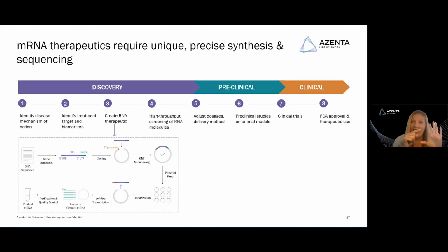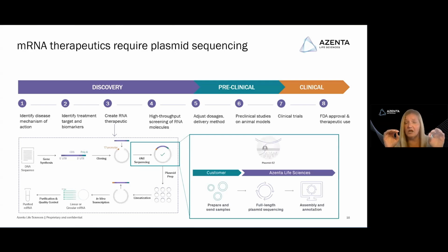The plasmid will have our backbone as well as our T7 promoter region, and we're going to put that all together, and then we need to sequence that plasmid to make sure it's intact. Again, we're going to be using our Oxford Nanopore plasmid easy sequencing, where we just submit the plasmid and we get those results back overnight. Here, again, random fragmentation, single fragments, so that we still get a long piece. But we're going to be looking for slightly different structural components.